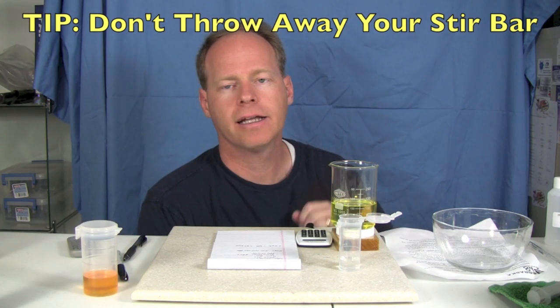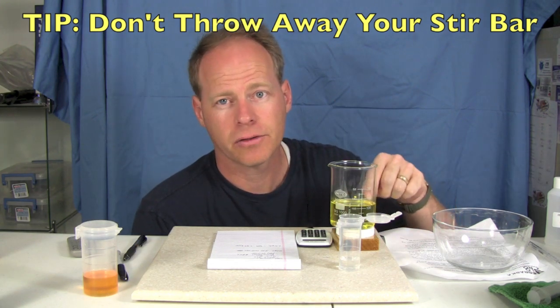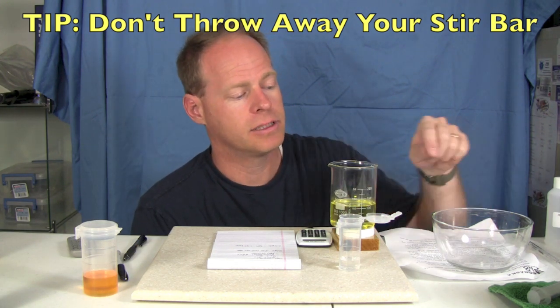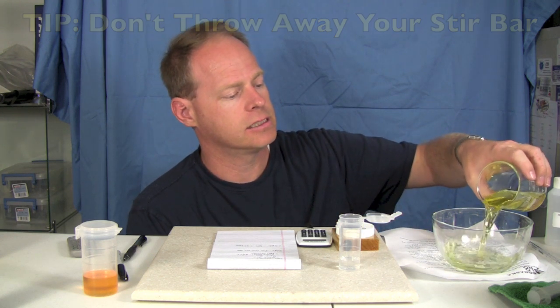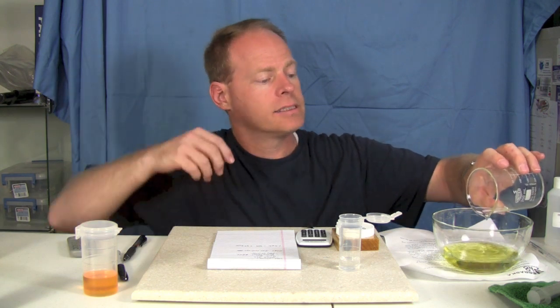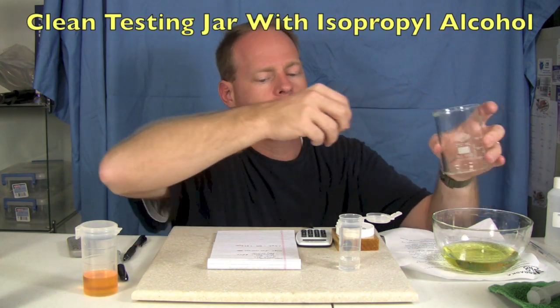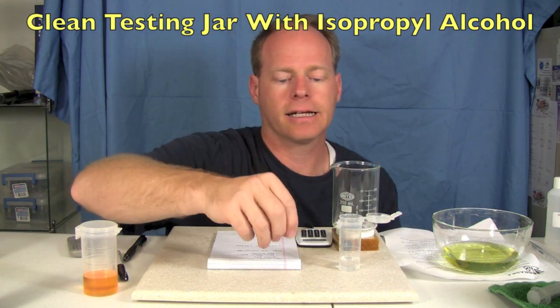We're going to test another batch and see how far it goes. When cleaning out your stir bar, make sure you don't throw away the stir bar — these stir bars are very tiny and it is very easy to lose them if you're not careful. If you want you can dump this into another vessel. I also like to clean my jar out with isopropyl alcohol just to get it cleaned back up.